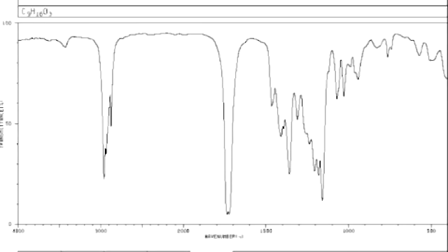And normally you might say one for the peak that looks like that. But if you look at the very bottom of the peak there, you can see that it has a little zigzag, denoting that this is in fact two separate carbonyl absorptions. I'm going to go ahead and guess that one's a ketone and the other's probably an ester. Moreover, we know that all those bonds are going to be saturated because everything is to the right of the 3000 mark there. I'm sorry, I meant everything will be saturated, not unsaturated.